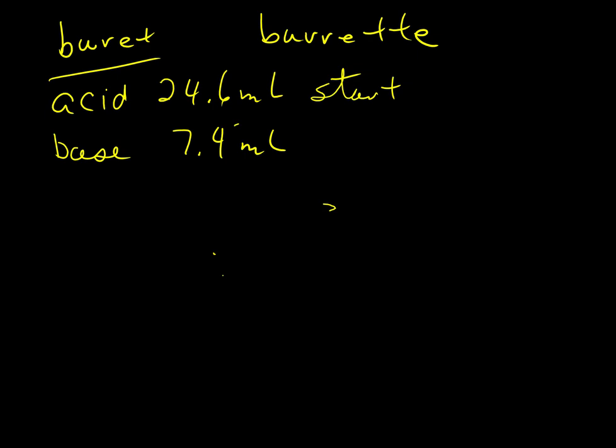And if I put a drop of phenolphthalein in there, it stays clear. It only takes 1 drop. And then I add the base until it turns pink and stays pink.